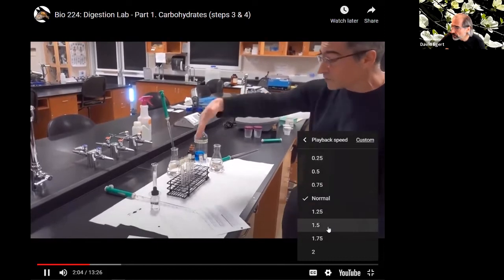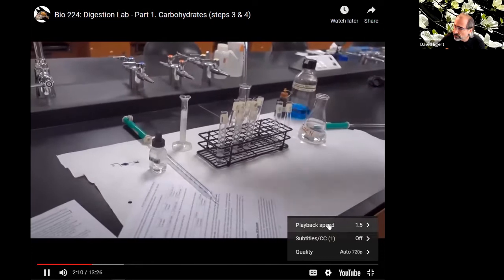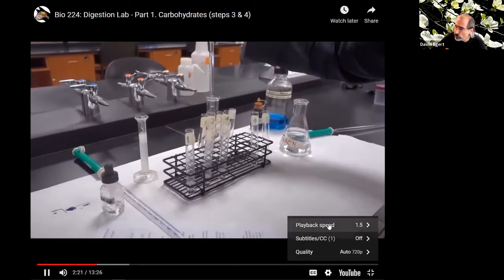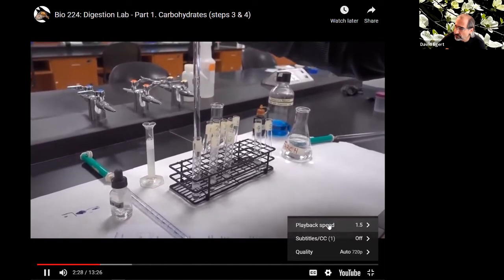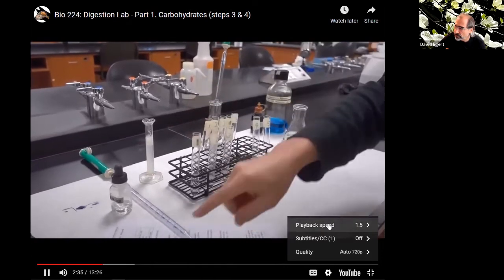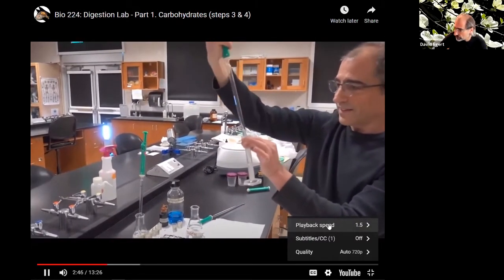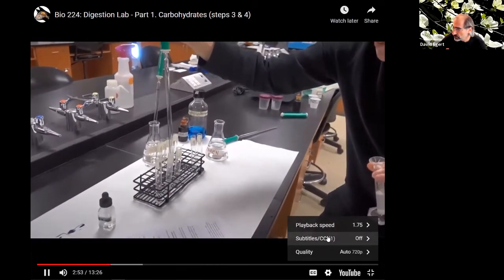All right, so we have starch in our 3 unknown tubes here. Test tube 1 is going to just fill out our volume by adding 3 mL of water. So we got 3 mL of water in test tube 1. Test tube 2, we have to add 3 mL of this quality high grade saliva. I'm just going to bring this up to 7, so we spit it out. I'm going to spit it up into there.